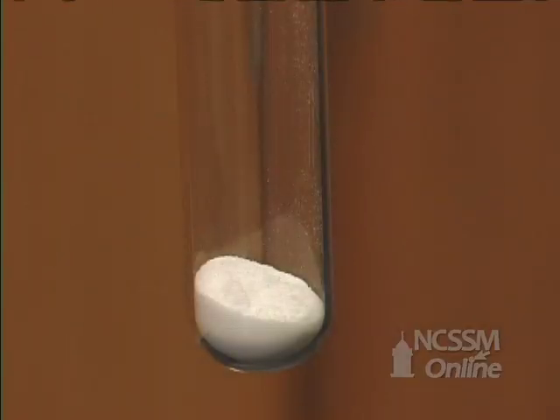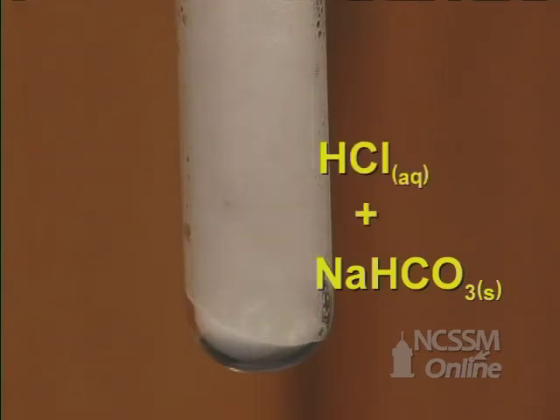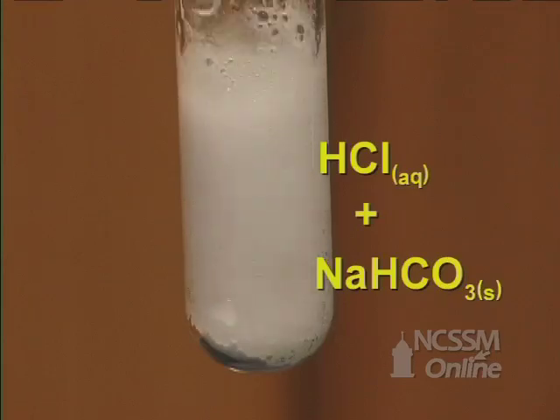In the double displacement reaction of a metal hydrogen carbonate with an acid, we start out with white sodium hydrogen carbonate and we'll add a solution of hydrochloric acid.